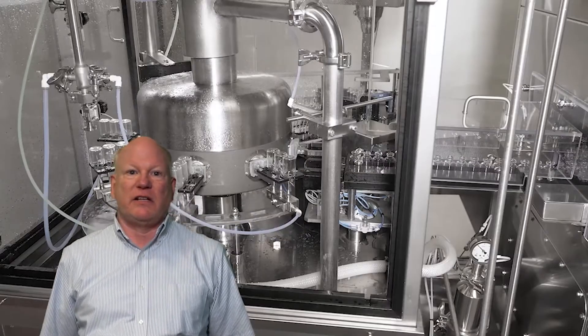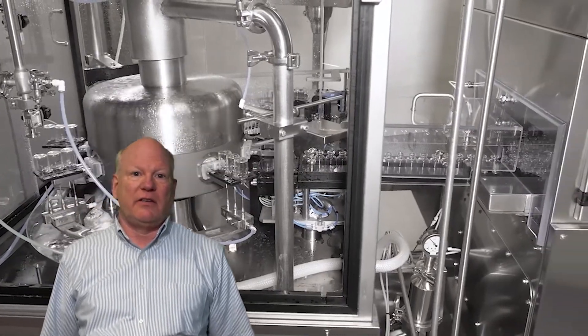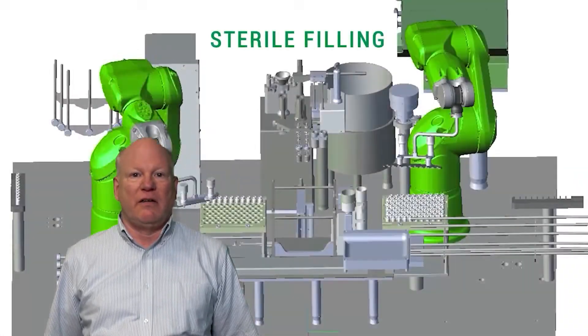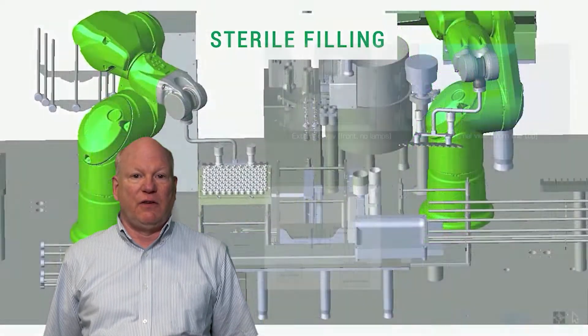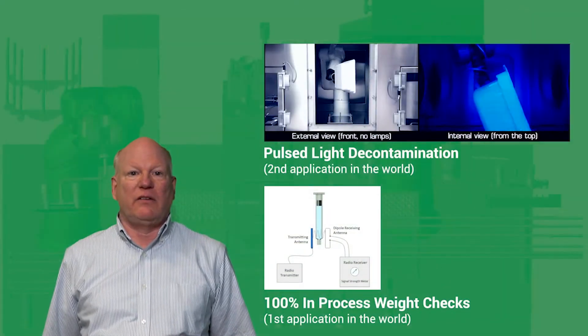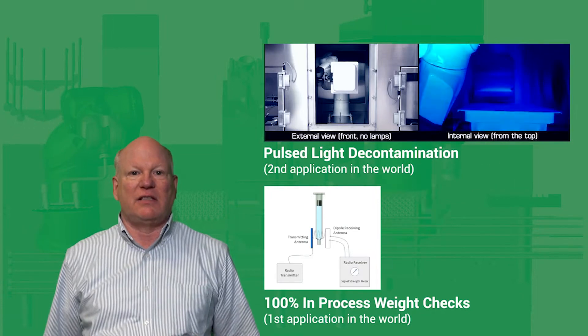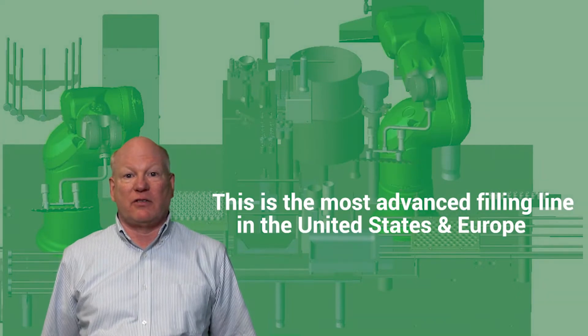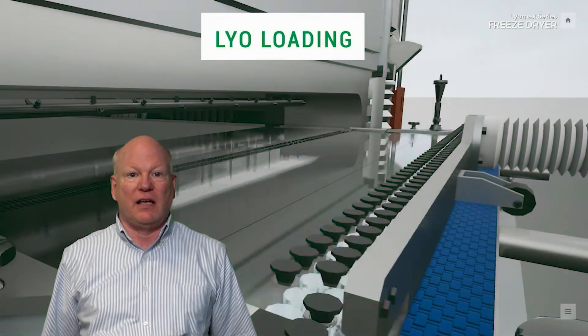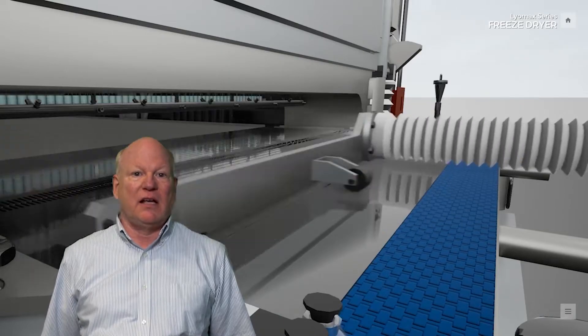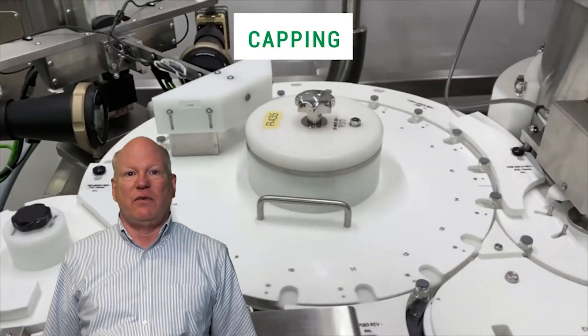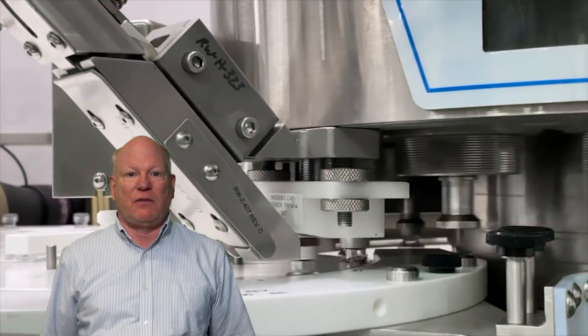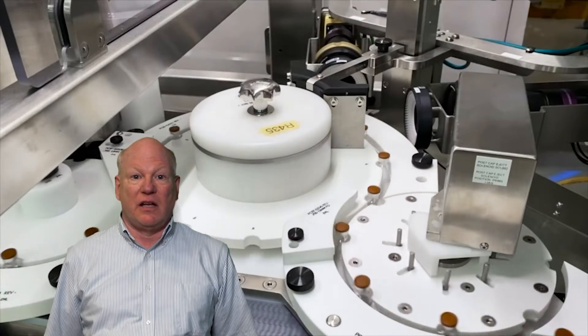This line uses VHP to sterilize the equipment, just like the other two filling lines you saw. This line is entirely isolator-based to protect the sterility of the medicine we fill, and it features two brand-new technologies, one of the first in the world, and another is the second application in the world. This is the most advanced filling line for small-scale drug manufacturing in the United States and Europe today, and we've worked with five companies to design, construct, and test this over the past three years. It cost approximately $10 million to construct this line, and we begin manufacturing injectable medicines in August of this year.